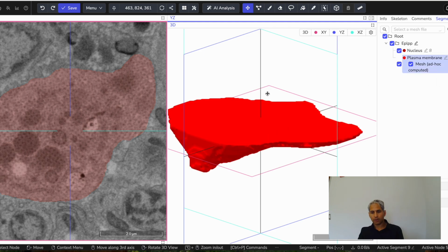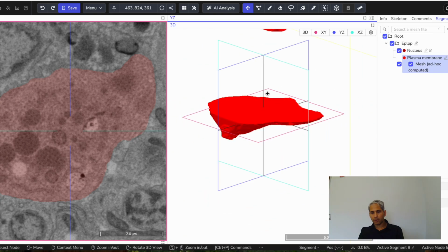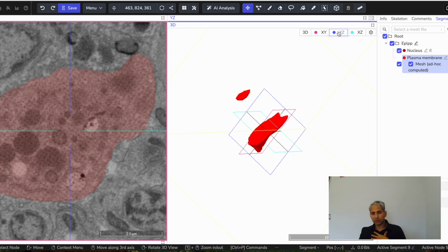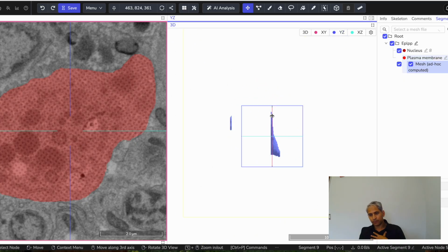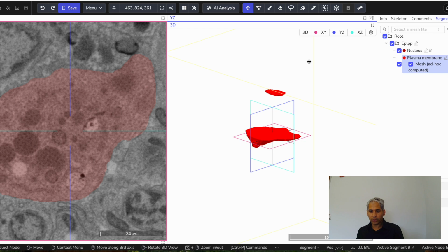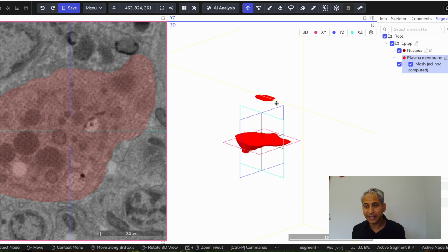Wow. So now the bottom of my cell, the entire cell, the boundaries of the plasma membrane have been annotated. So it filled in the entire cell and the very top of the cell. That's the work I did today. Let me rotate it around. You can see that I did one end of the cell and the other end, altogether 10 slices. And we can flip it around this way as well. We can do this slanted way, 3D. This is what I did today in terms of annotating the entire cell boundaries by tracing the plasma membrane.